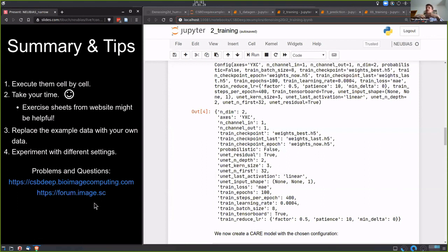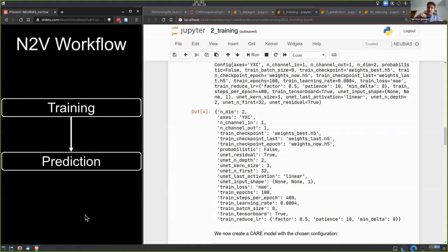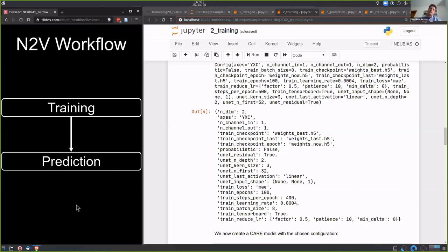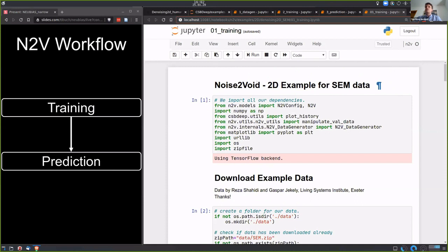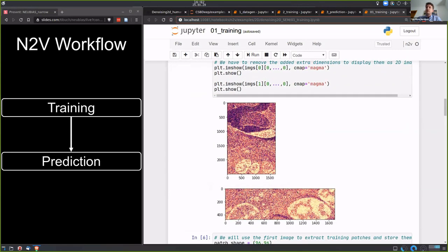Now I'll move to the Noise2Void workflow, which is almost the same but with a key difference: it only has two steps — training and prediction — because Noise2Void doesn't require paired low-quality and high-quality images. You just use your noisy images, which makes data preparation much simpler and it's folded directly into the training notebook. Here I have the Noise2Void 2D example on SEM data open. You download some data, open the images, and extract training and validation patches — no ground truth targets are needed.